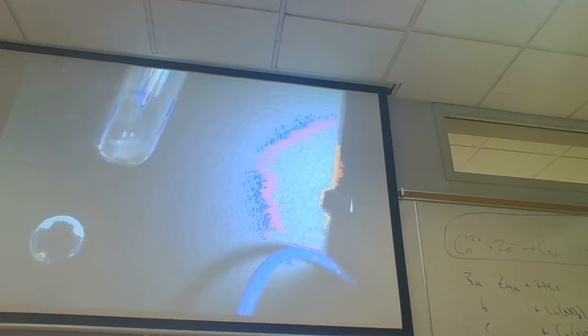All right. Can you see it there? Yes. Okay. It just looks like a gray. It's been powdered or pulverized, but it looks like a gray metal. It could have some oxidation on there.